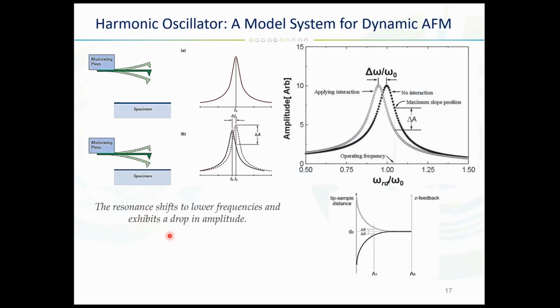So this is the first parameter. The second parameter is the free vibration amplitude. This is the amplitude of the oscillation that occurs when we have some free space between the cantilever and the sample, and this parameter is set in units of voltage. Rougher samples will need a larger free vibration amplitude.